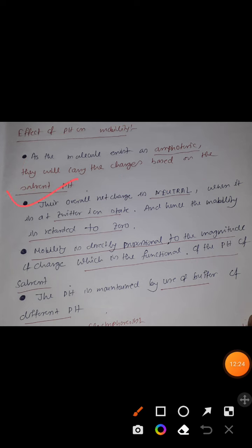Here I have also discussed that the overall net charge is neutral when a particular molecule is in the zwitterionic state. Zwitterion means an equal amount of positive charge and negative charge. Do not think of a zwitterion as having zero charge; the net charge is neutral, and hence the mobility is retarded to 0.